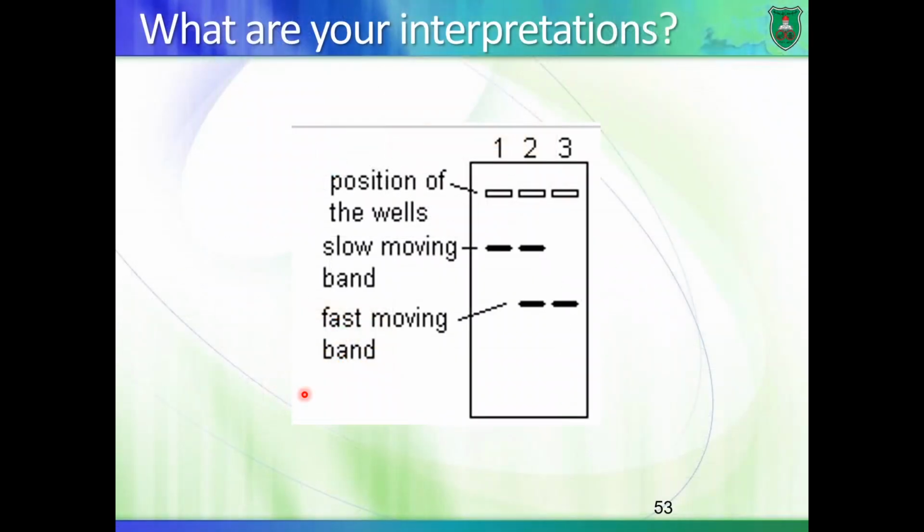Now, this course is about thinking. Okay, so now let's look here. We have three samples, 1, 2, and 3. We have total messenger RNA, molecules separated through the agarose gel again. We add a probe, and here what do we see? We see a band that is at a certain size, whatever the size is. Let's say it's about 4 kilobase long. Remember, it's not base pair because it's single-stranded. It's messenger RNA, so it's 4 kilobase. Okay, that's in sample 1.